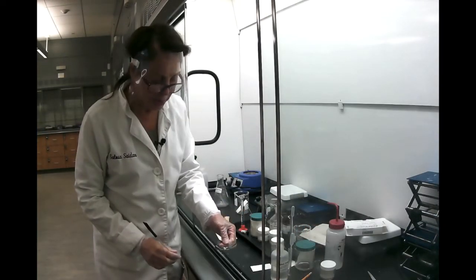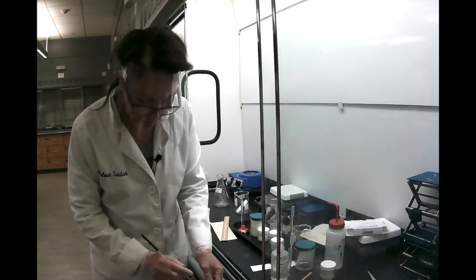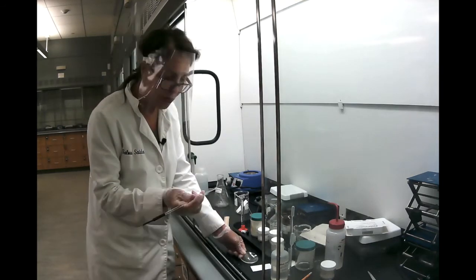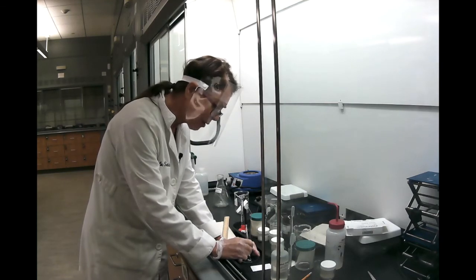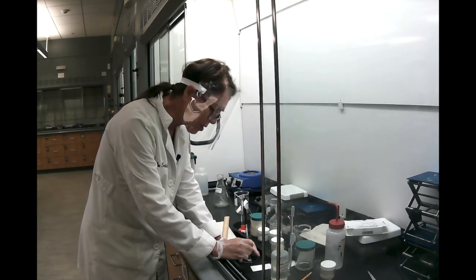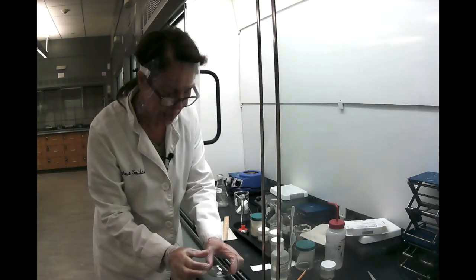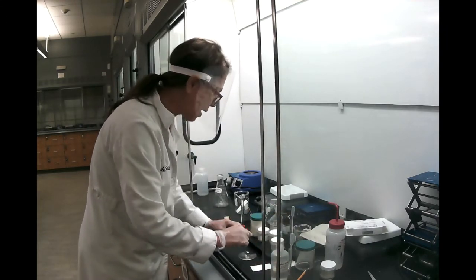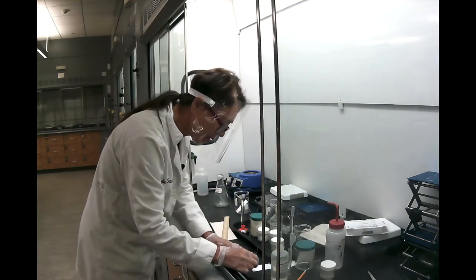So here's another substance that comes in little flakes like this. What we suggest, and that's the reason we use a watch glass, is to use the glass rod and crush it slowly without going too hard on this. Just crush it a little bit to dissolve it. So first you crush it, make it slightly powdery here, and then, as usual, you put a few drops of your ethanol, make sure it dissolves, and then you spot it on your TLC plate.